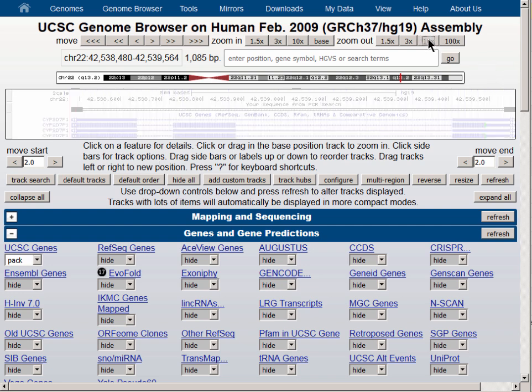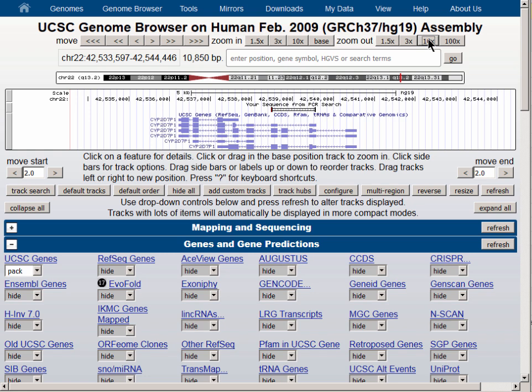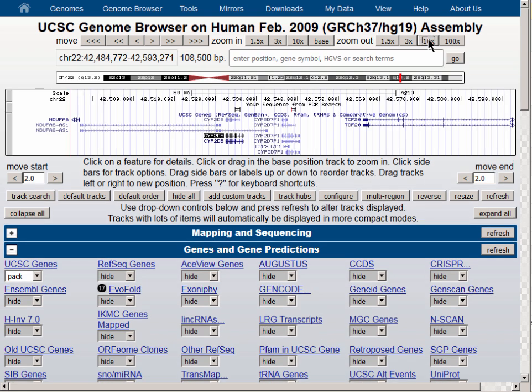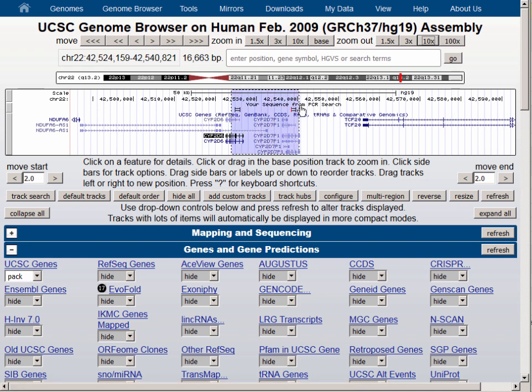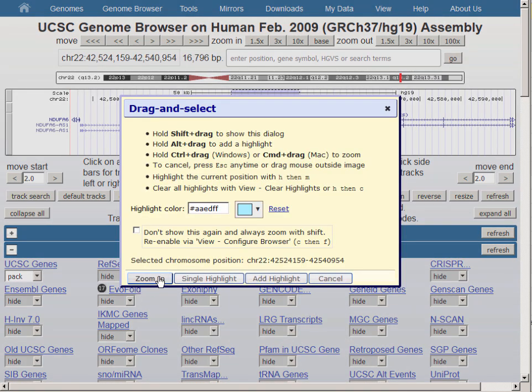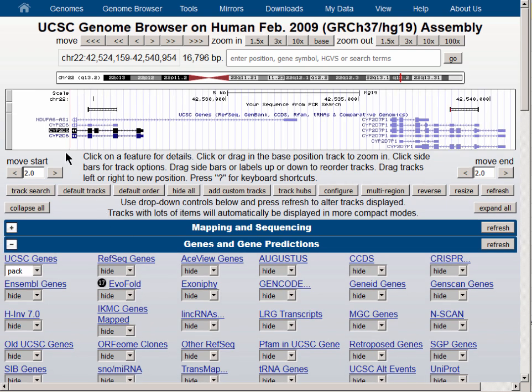Let's zoom out by a factor of 10x and then another factor of 10x, and we'll observe that there's a second amplicon to the left of this one that represents the CYP2D6 gene that we began with. In fact, the gene name is still highlighted from our having typed it into the position box when we navigated to this region of the genome. This illustrates one of the primary purposes of having the ISPCR tool: it represents an opportunity to confirm that your primers amplify uniquely in the genome and will not amplify at a location elsewhere that might not have been known or expected when the primers were originally chosen.